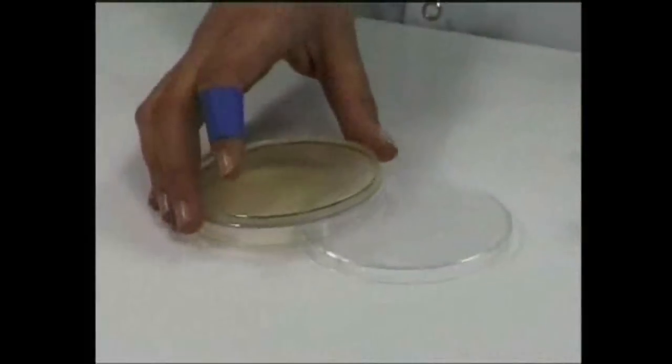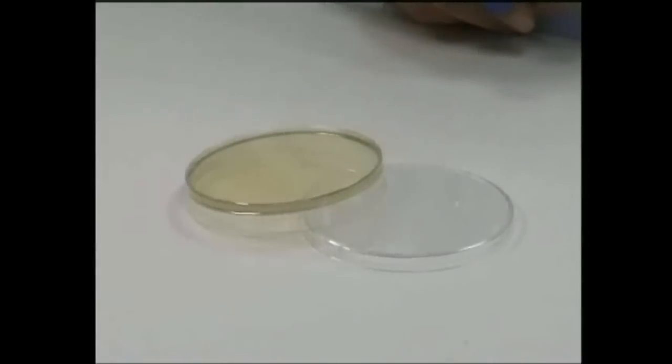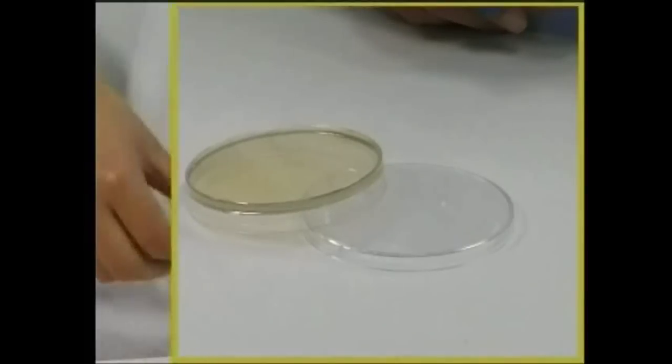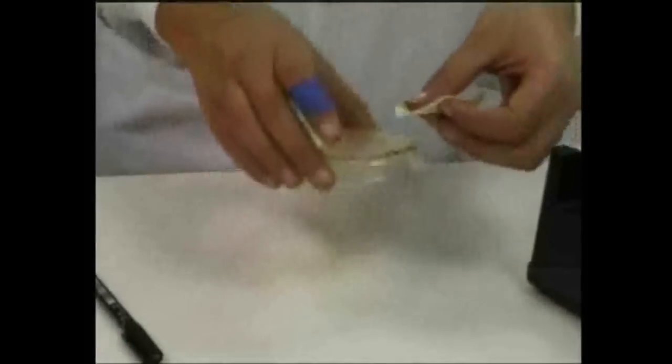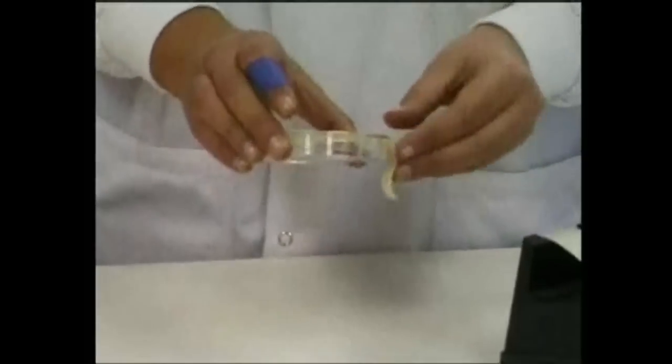Plates are always dried with the base inverted and resting on the lid to reduce the risk of contamination. Plates can be dried in an incubator, but it's also okay to dry them on a bench where they won't be moved. When plates are being inoculated, they should be sealed with short pieces of tape. Do not seal them completely, or this may encourage the growth of potentially harmful anaerobic bacteria.